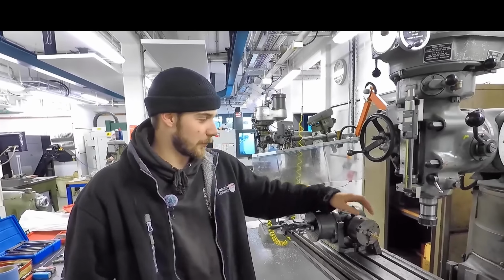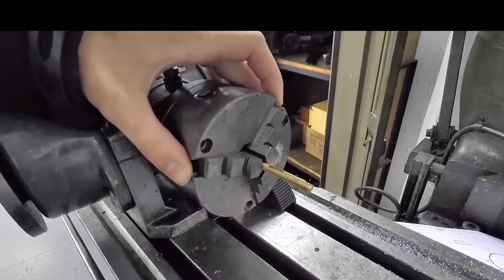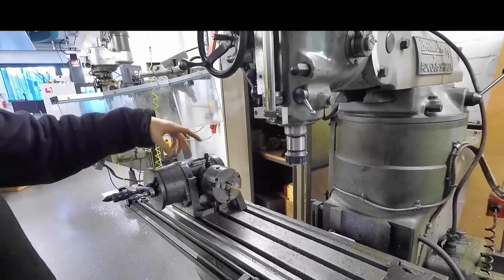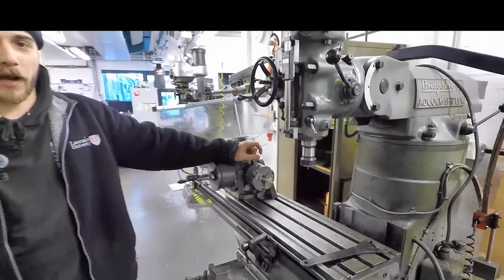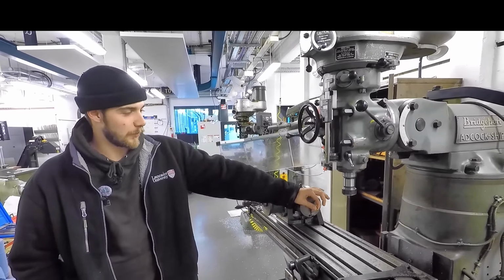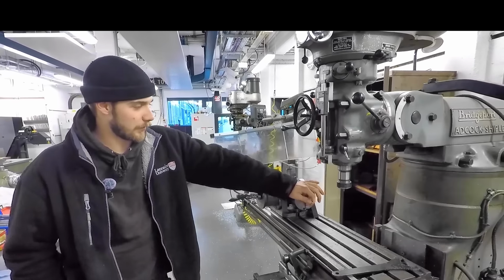So to make it, I used some standard M6 brass rod that I cut to a length of, I think, roughly 50 mil. Then, using a cutter mounted in the collet chuck and a dividing head set to 90 degrees, I ran the cutter along and took a few different passes so it didn't take too much depth out at once, reducing the amount of movement in the part, which was the main issue. That's why a few of the first ones failed, because the part had moved too much.